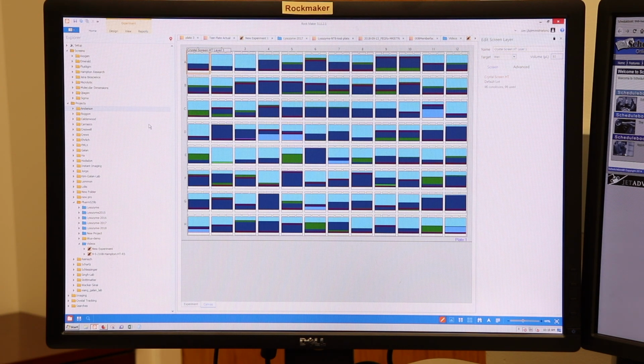So we picked up with, now we have to add a protein to the layer. Okay. So that will start in about 2 seconds here. So we'll go back to your project file here, and now we're going to add a protein.